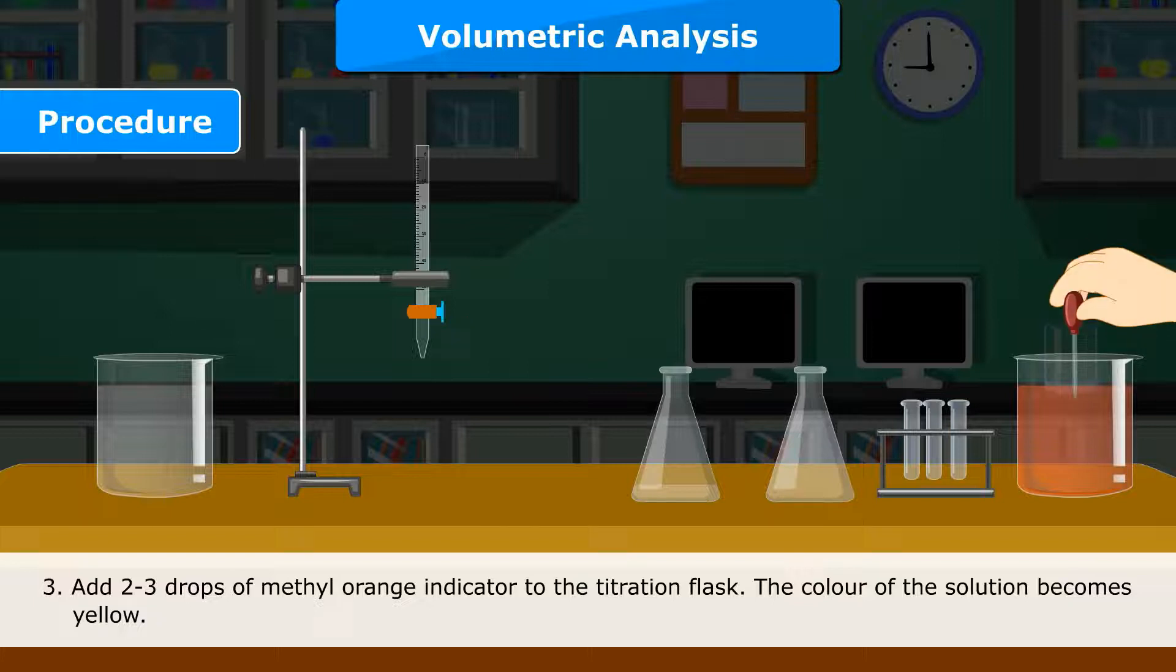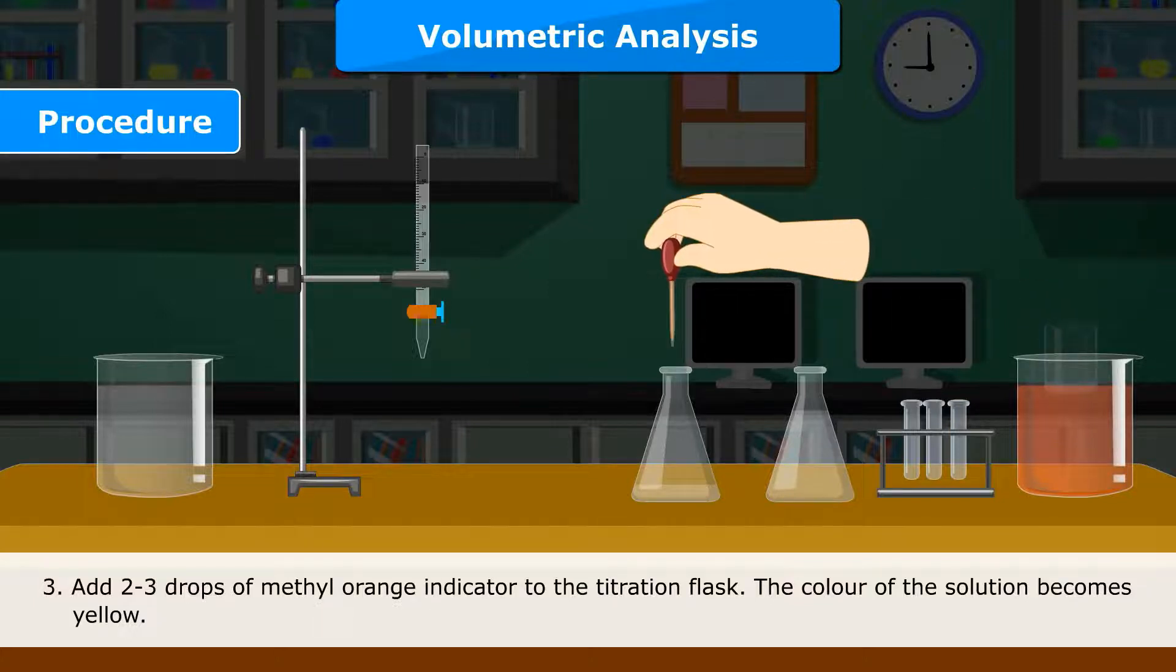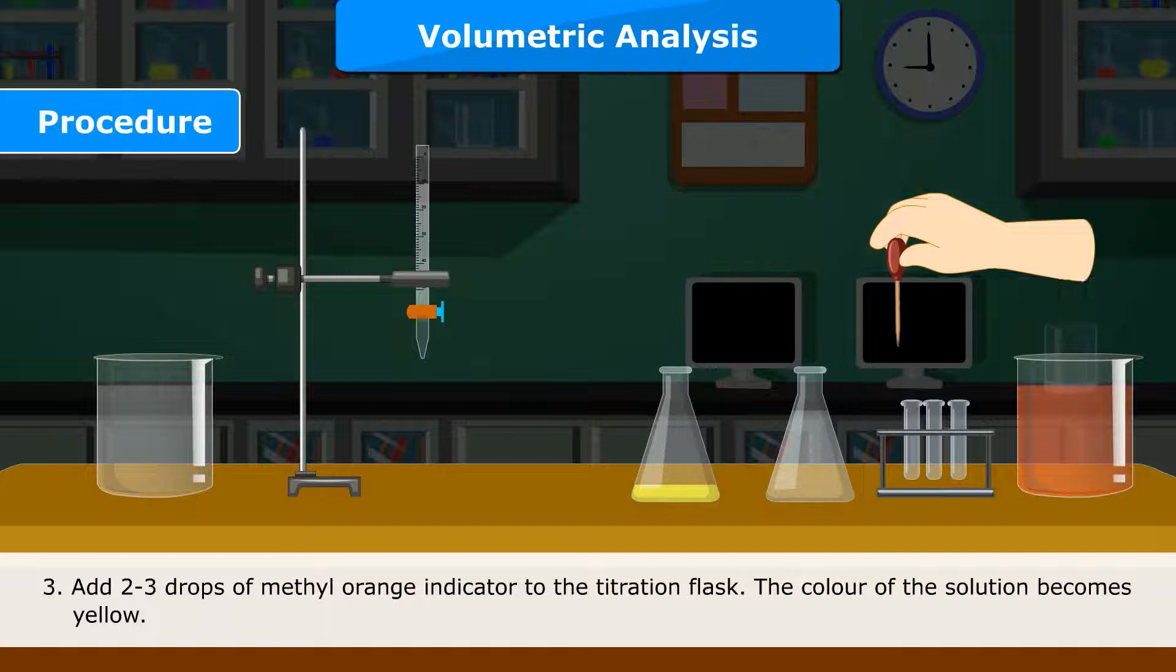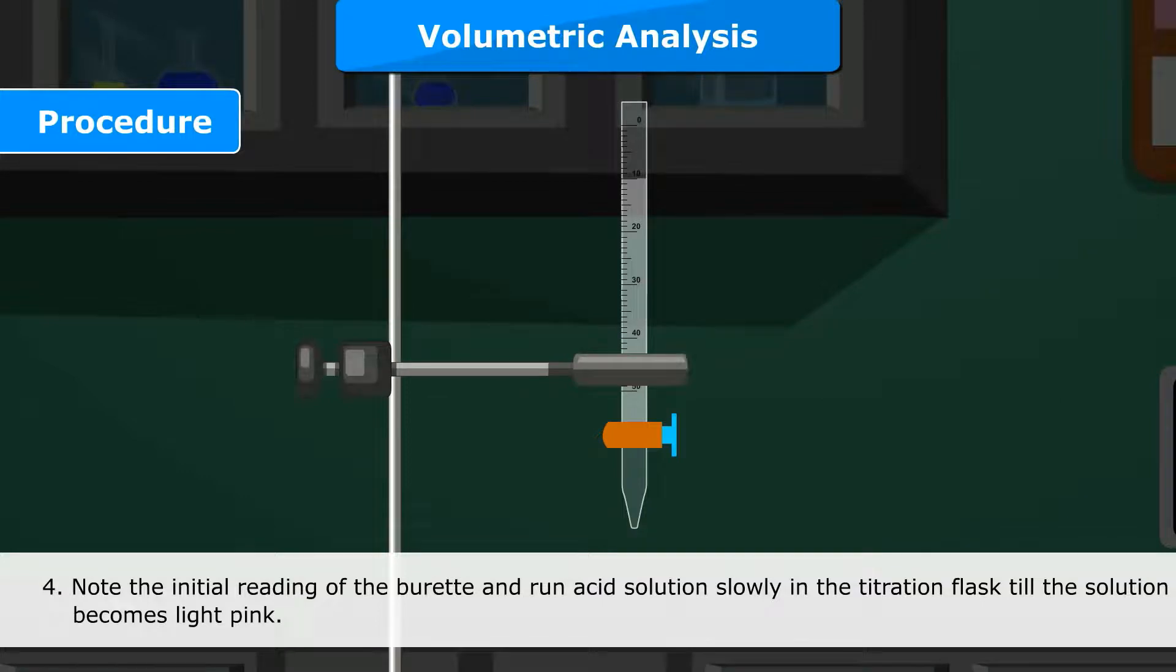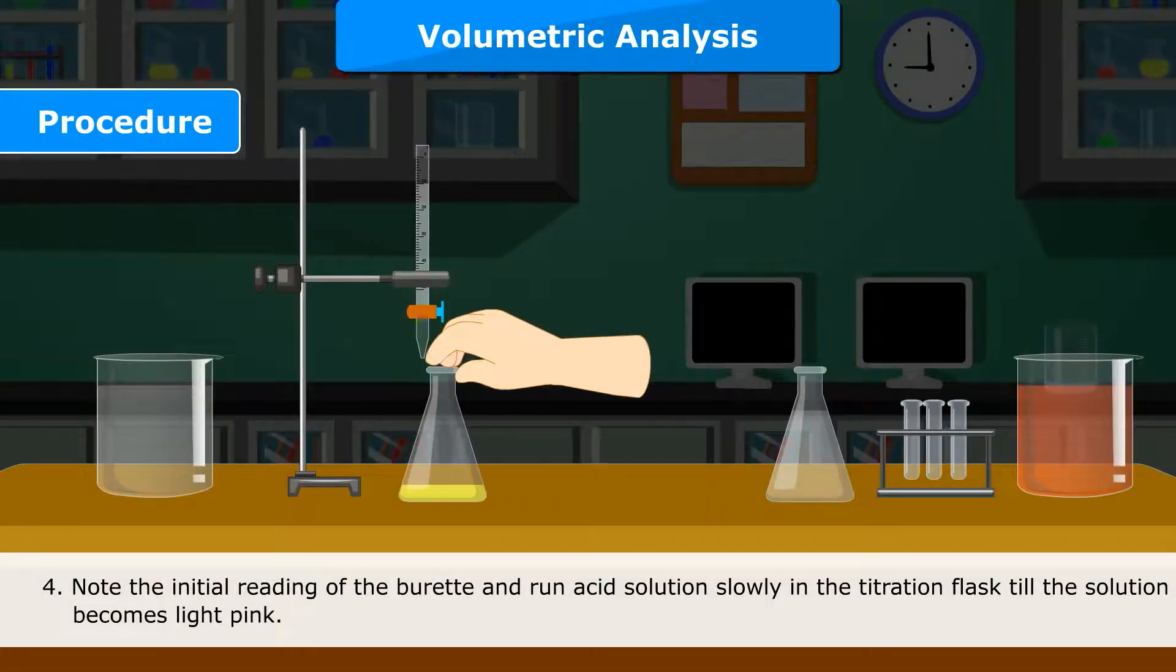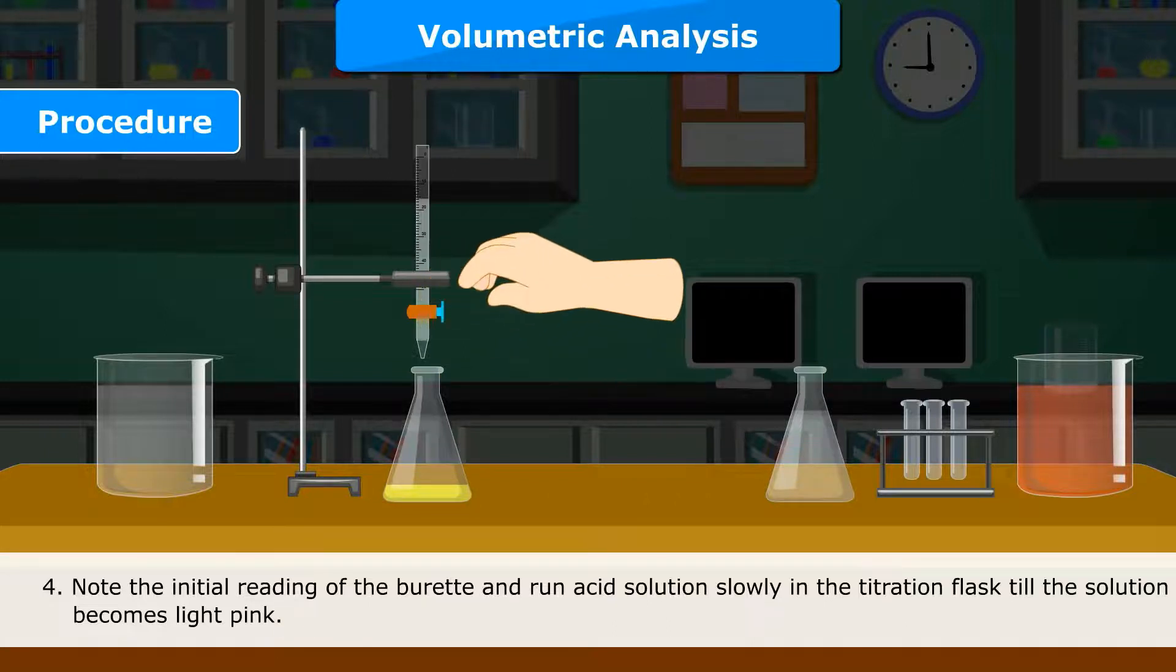Add 2-3 drops of methyl orange indicator to the titration flask. The color of the solution becomes yellow. Note the initial reading of the burette and run acid solution slowly in the titration flask till the solution becomes light pink.